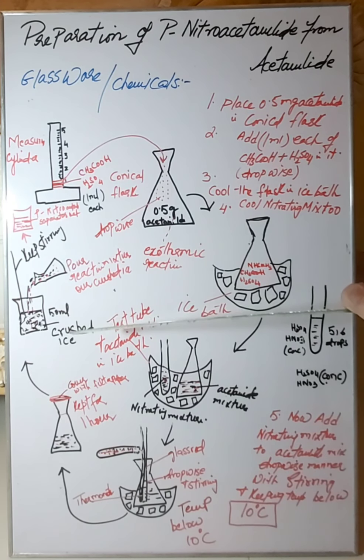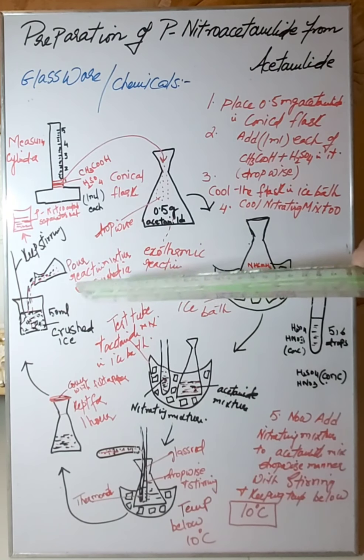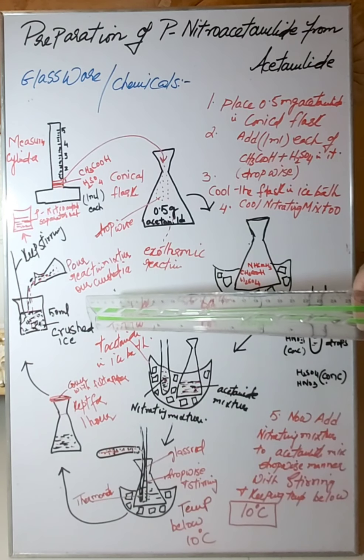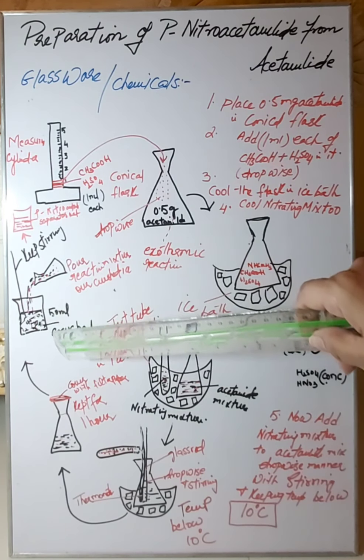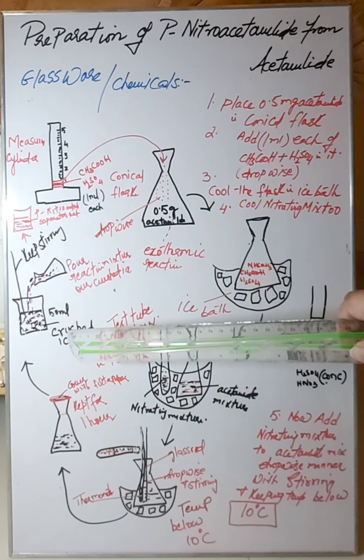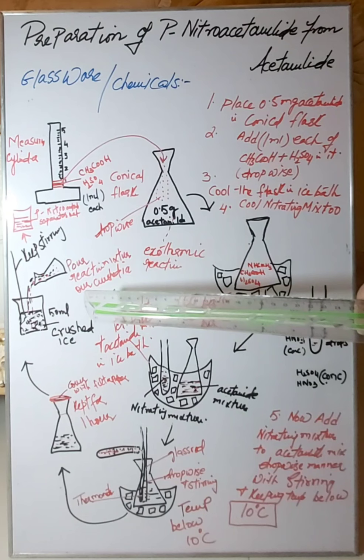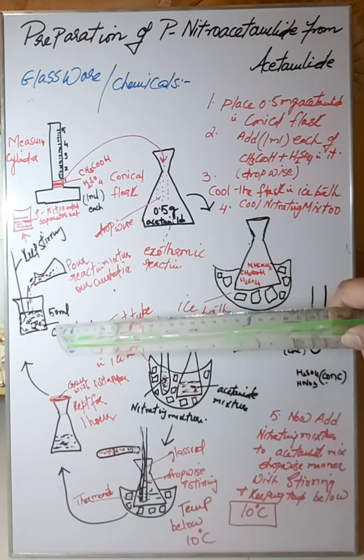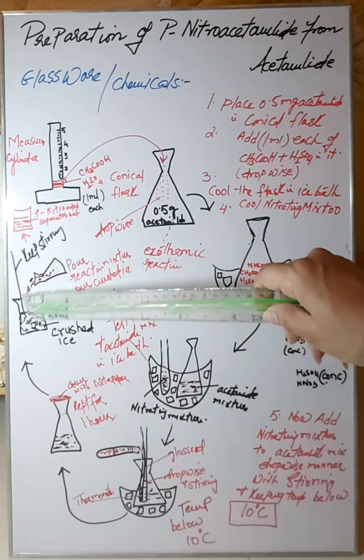Let the precipitates form. Now again, you are going to use a Buchner funnel. I told you what a Buchner funnel is: a funnel that has small holes inside it. If you do not have a Buchner funnel, you can use an ordinary funnel and do the filtration by keeping a filter paper inside the funnel, and you can filter these precipitates, right?